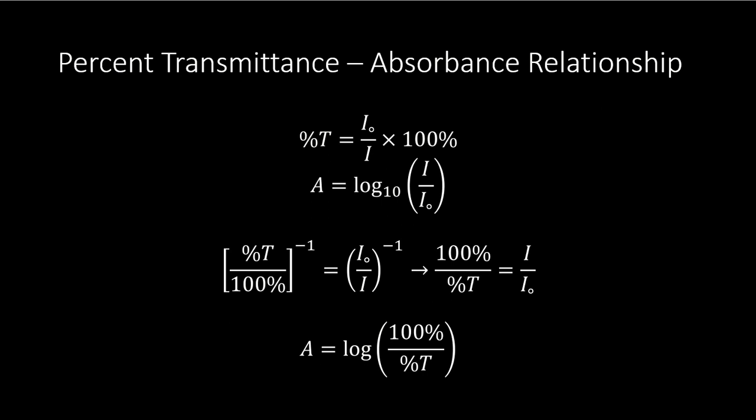Therefore, you'll be able to quickly record both, but if you are only given either absorbance or percent transmittance, here is an example relationship you would be able to use. In any case, that concludes this lesson on our colorimetric determination of an equilibrium constant for our experiments.